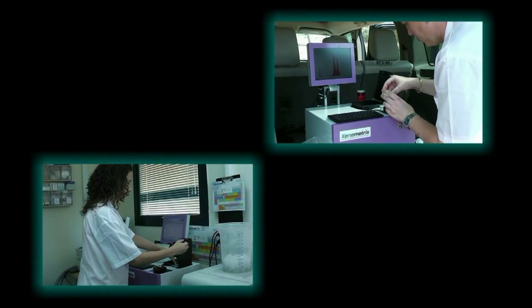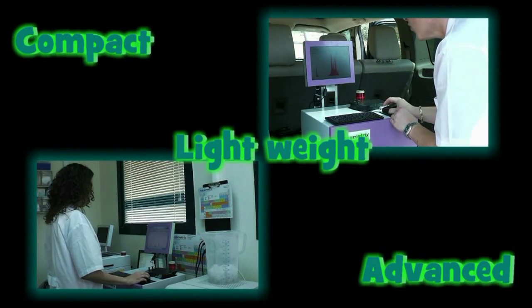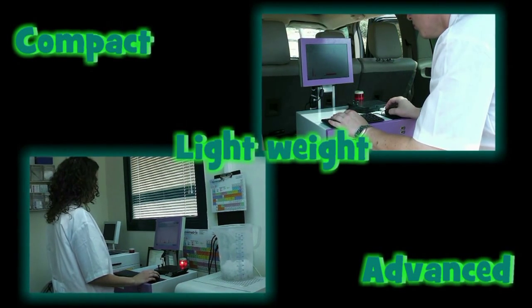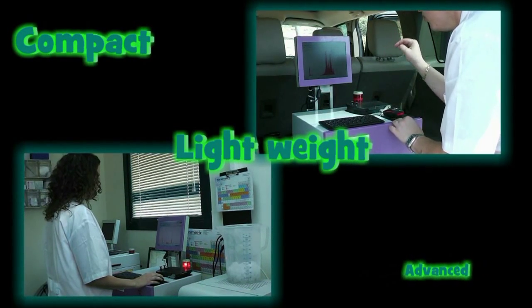Xenometrix's S-Mobile is an advanced, compact, lightweight energy-dispersive X-ray fluorescent spectrometer that brings the power of a laboratory spectrometer to the field as a standalone system or as part of a mobile laboratory.